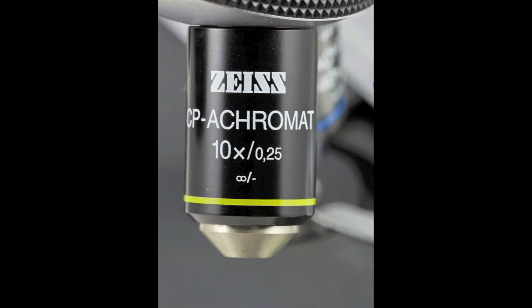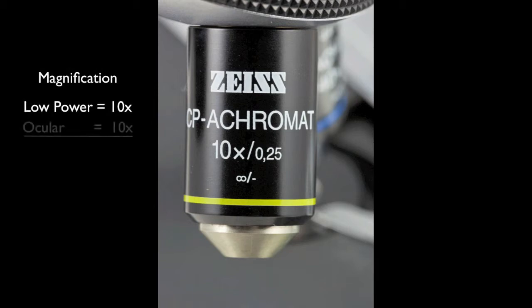The next lens to use is the low power objective, the one with the yellow band. This lens magnifies objects 10 times. The ocular lens magnifies the image 10 times for a total magnification of 100x. When viewing larger objects, this may be sufficient magnification to get a clear view.